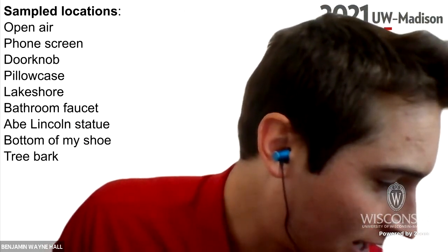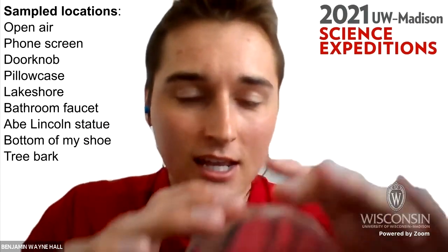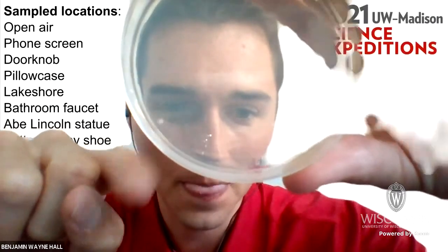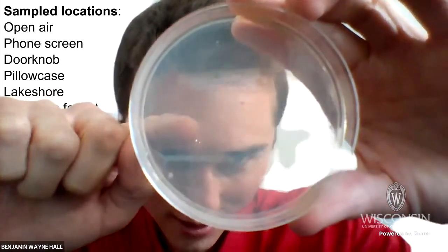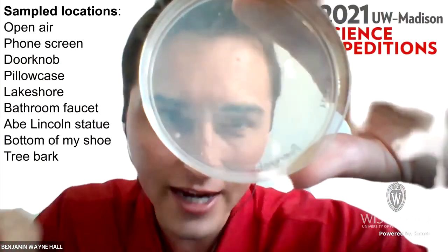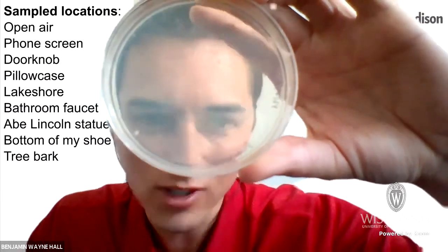So let's get another one that people guessed. So here is a doorknob. We've got one nice big colony in the corner here that I point out with my finger. And then we have another up here. Oh, you can see it if we hold it in front of my hair because it's a dark background. So we've got another one up here, another couple off to the side here. So it looks like the doorknob is about on the same order as the phone screen, where we see a couple of colonies, but it's definitely not covering the whole plate.